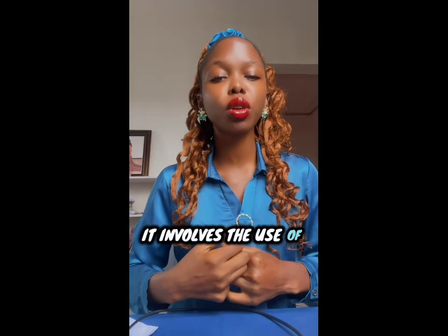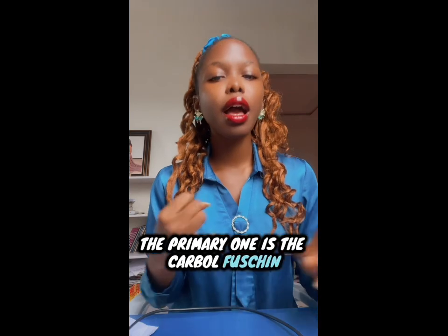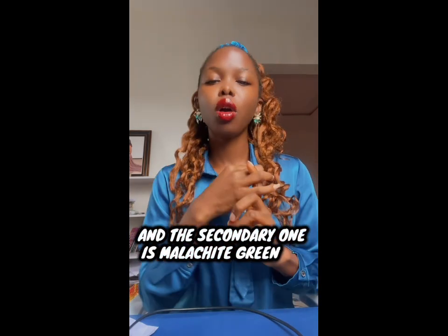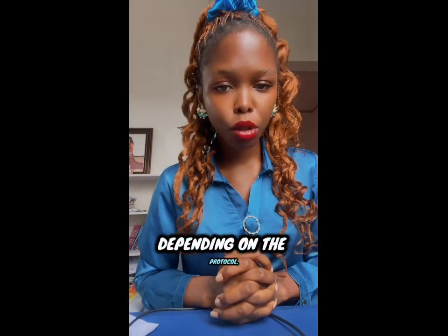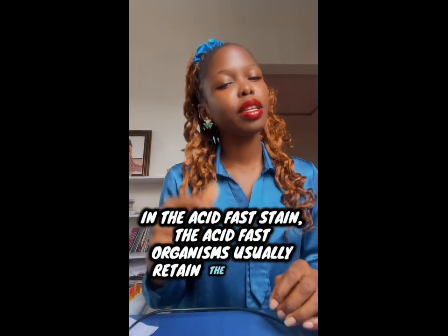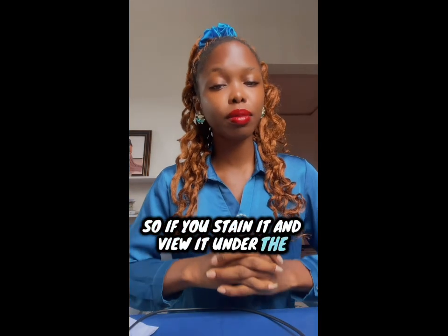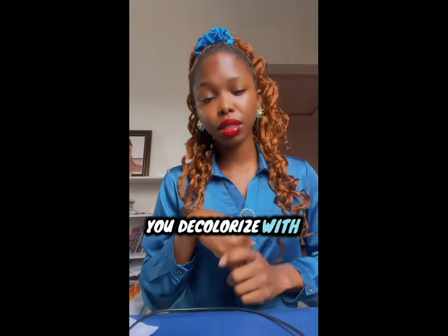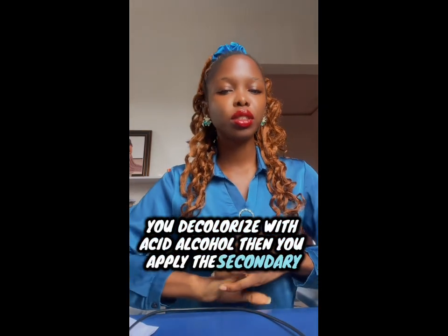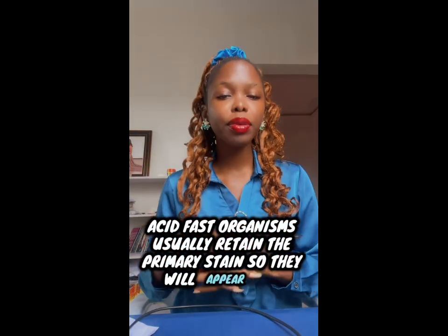It involves the use of the Ziehl-Neelsen stain, which is a differential stain that has two types of dye. The primary one is carbol fuchsin, and the secondary one is malachite green or methylene blue, depending on the protocol. In the acid-fast stain, the acid-fast organisms usually retain the primary stain, carbol fuchsin. So if you stain it and view it under the microscope, it appears red. You apply the primary stain, you decolorize with acid alcohol, then you apply the secondary stain. Acid-fast organisms usually retain the primary stain, so they will appear red.